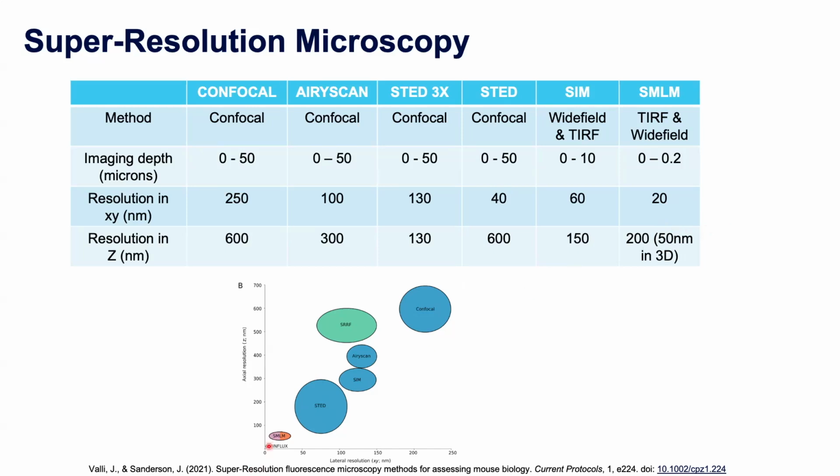And the final system, which I won't cover today, is MINFLUX, which is a combination of STED and single molecule imaging, but I'm not aware of any of those systems within Australia.